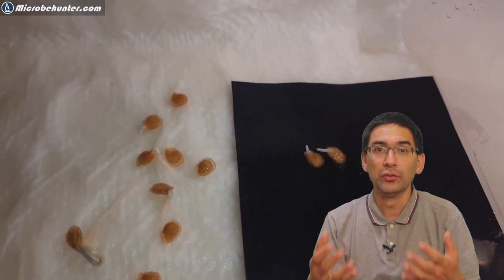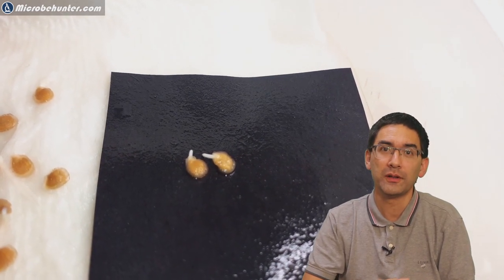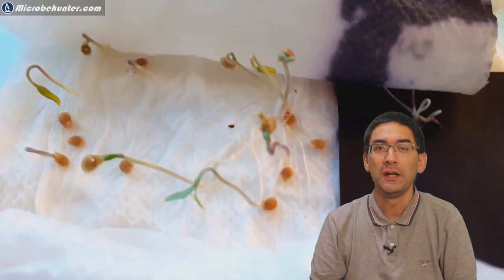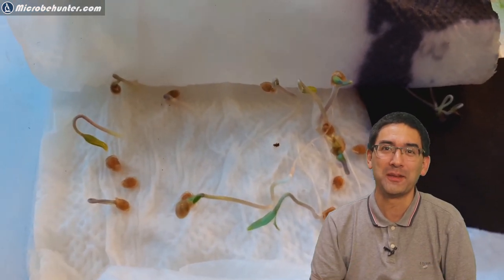In order to see the root growth better, I also placed black paper on the tissue, which is also moist, and then I put the seed on top. Unfortunately the black paper that I used also started to color off, which is not something that should have happened.